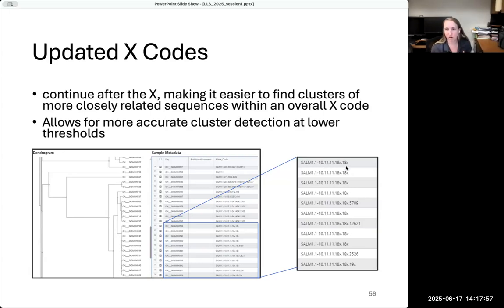So the 4th and the 5th digit are going to be at least 4 times greater than they're expected to be. I think the 4th digit was 15, if I remember correctly, so they're up to at least 60 differences. And then this one, I think it was 4, so they're up to 16 differences in those digits. That's all I can really say from looking at this, because it doesn't say what the actual distances are.